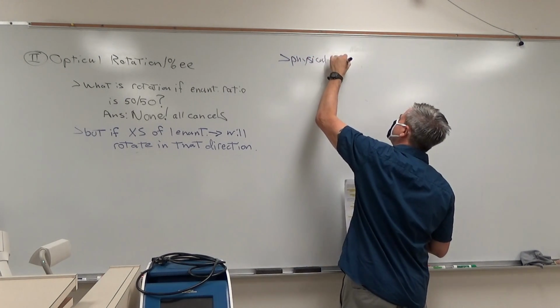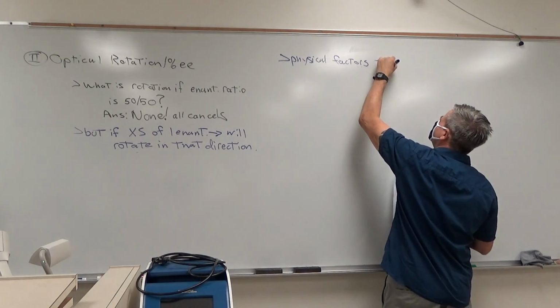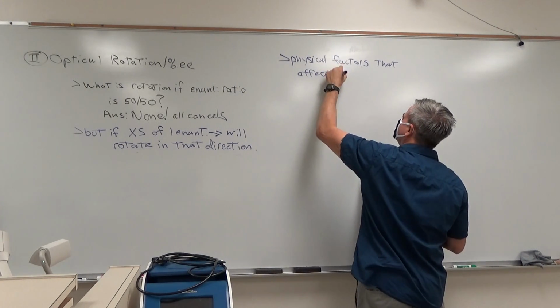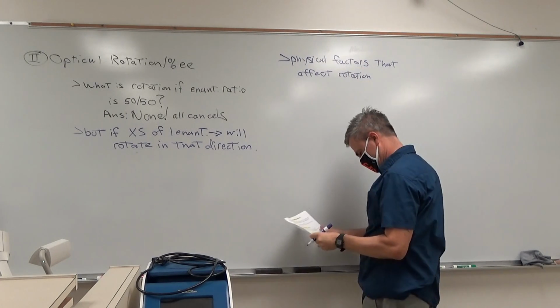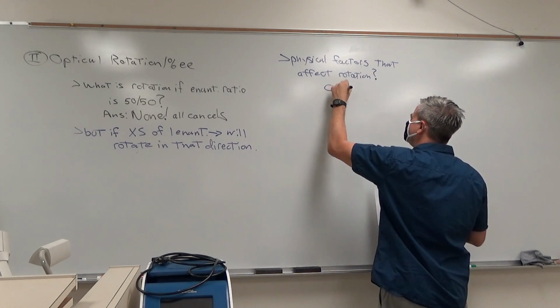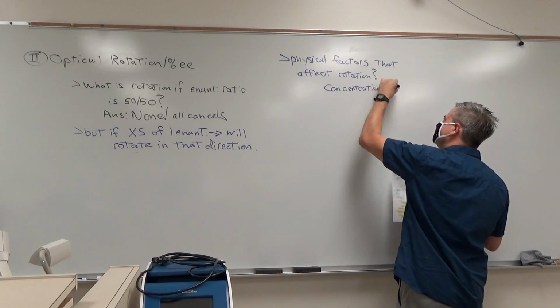Physical factors that affect rotation: concentration and cell length.